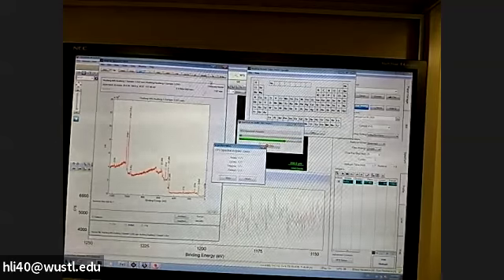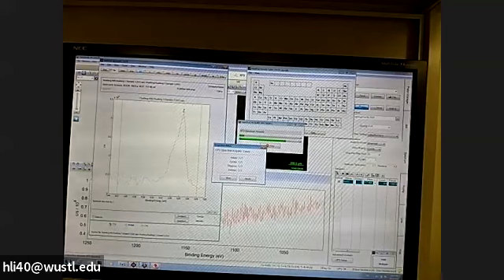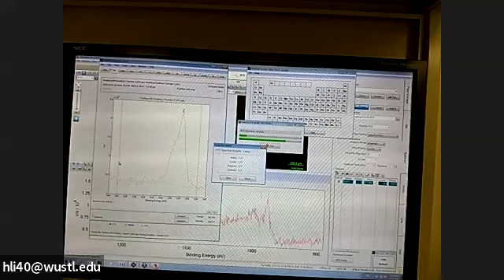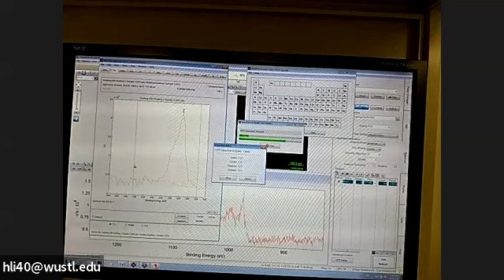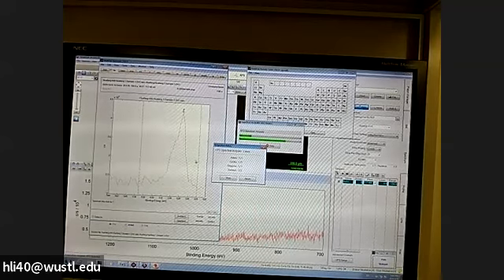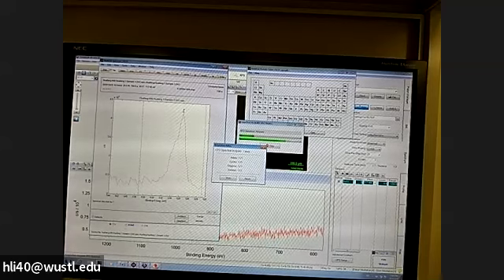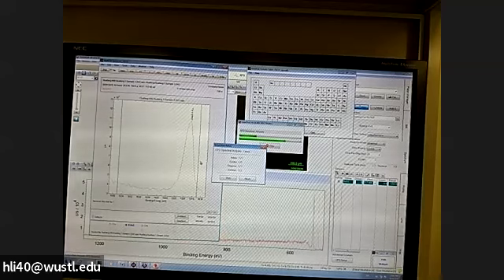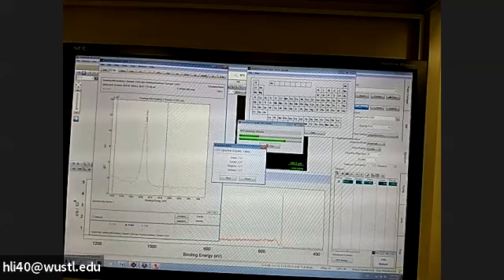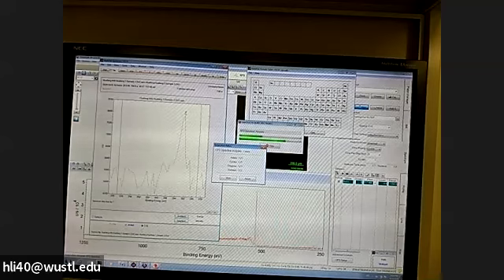So you can also do quantification if you like. These are 3 elements. If we take a look, we can select the element oxygen, and we drag this red line here. You will see a dashed line. That's a baseline. Normally for quantification, make sure the dashed line is the right baseline you like. Okay, zinc, it's 2p3. So we can drag to here, and then this is the right baseline. And the carbon.